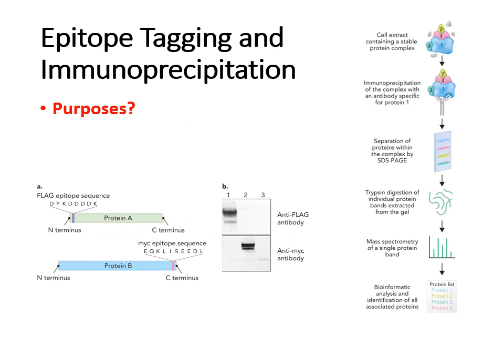Now, sometimes you're doing experiments on proteins that have not been thoroughly studied by other researchers, meaning there may not be an antibody to target that particular protein, to pull it down, or to visualize it in a Western blot, for instance.